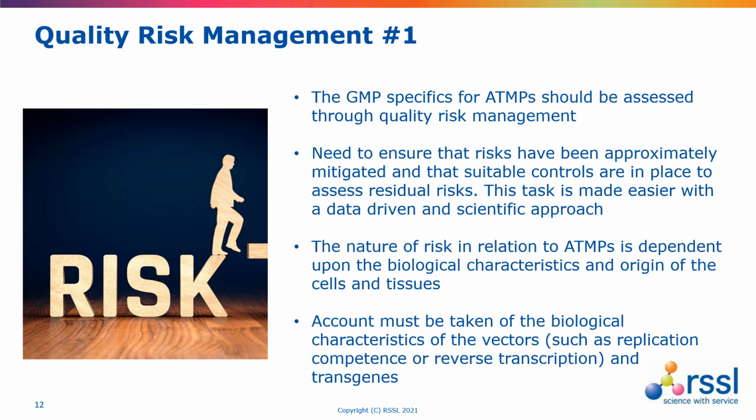And these will need to be tailored to the specific risks of the product and the variations and complexities of multiple steps within the manufacturing process. So there's a specific reference there that some of the general aspects of risk assessment will apply, but equally there will be some special areas as well.